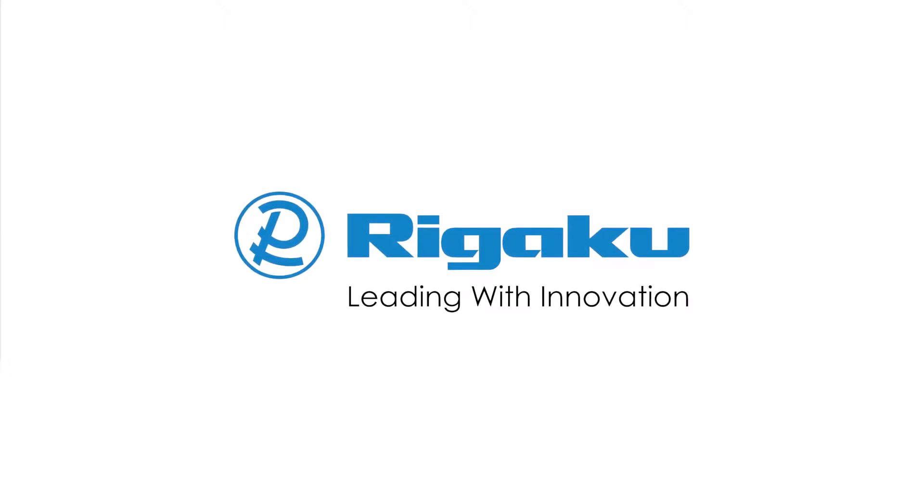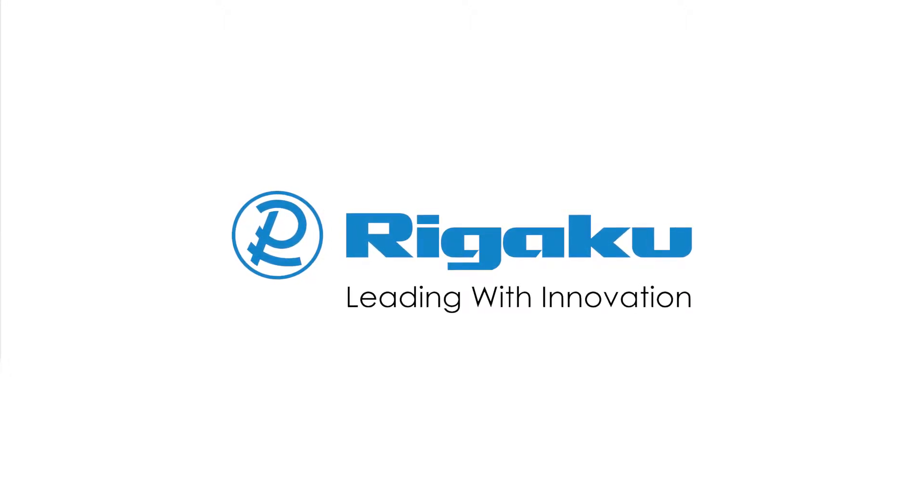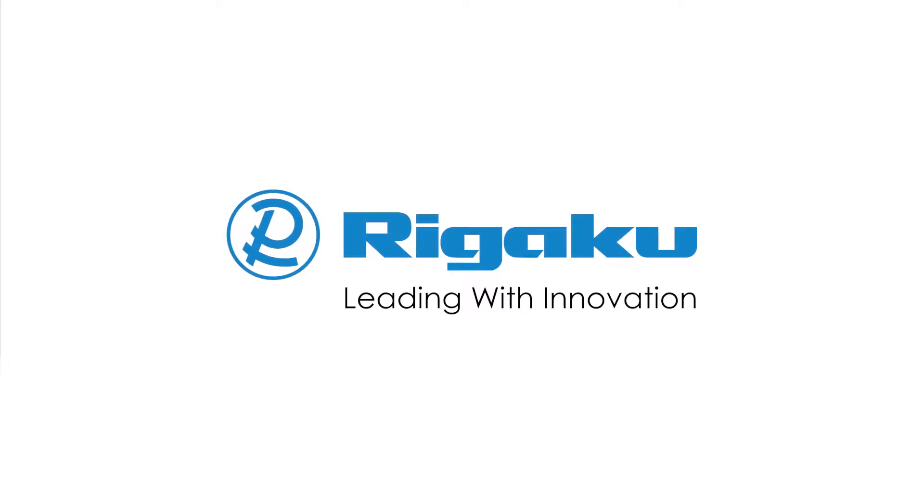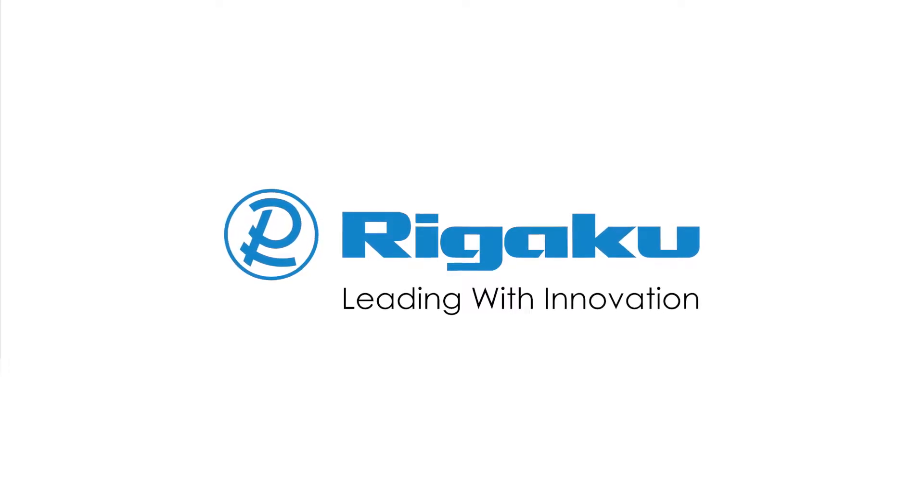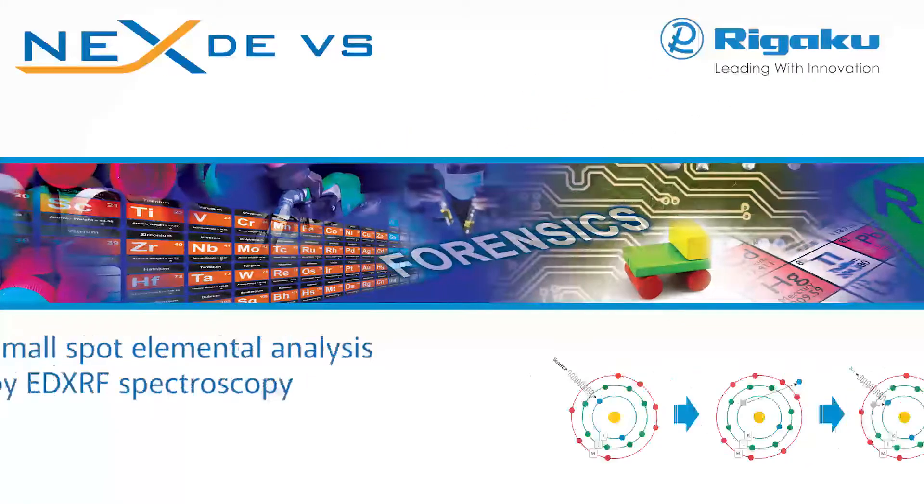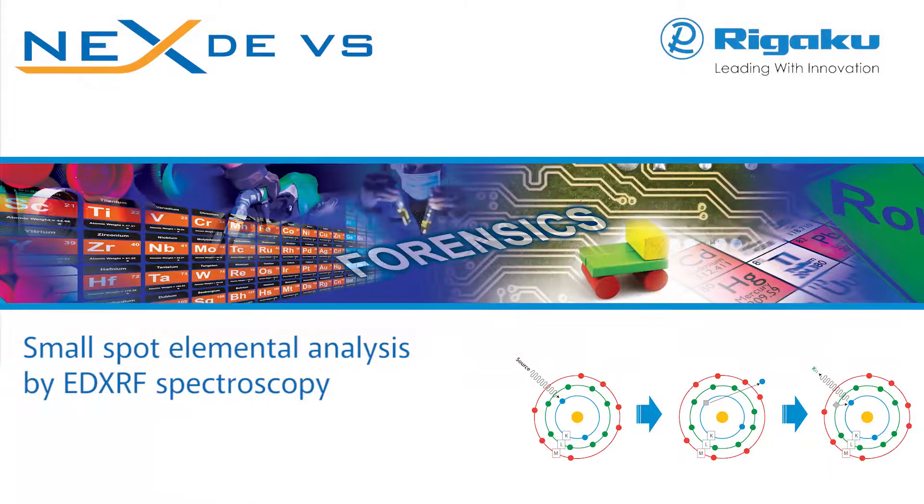Rigaku, the world's leading analytical X-ray instruments company, offers a state-of-the-art solution for your elemental analysis needs.